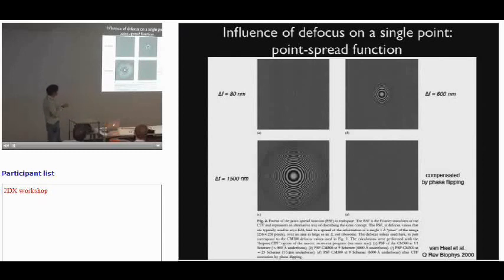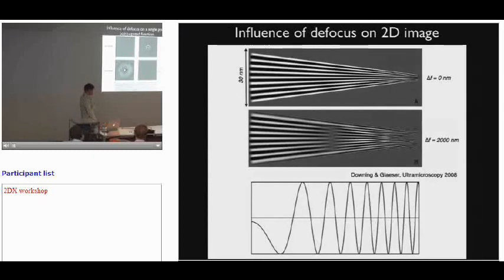So this could correspond to a ribosome kind of extension if you think about it, which means a single type of image is being displaced that much. And now, of course, there are ways of dealing with this. For example, if you just use a phase flip on the information, then you get your pixel back fairly reliably. But I'm going to explain this a bit more in detail.